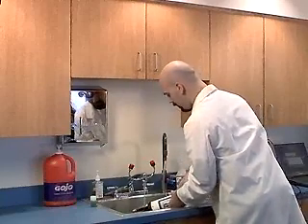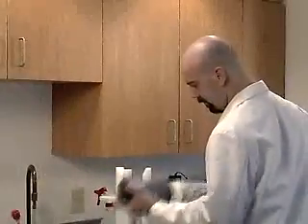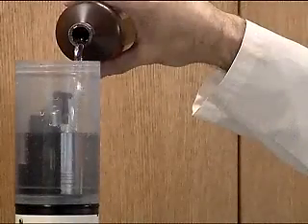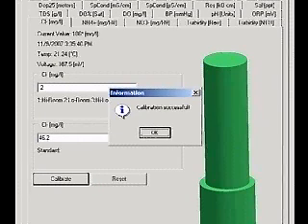Rinse the cup and sensors with deionized water and dry them. Fill the cup about 25% with the room temperature low standard and screw the storage cap on. Shake for six seconds. Remove the storage cap and pour the standard out. Fill the cup with room temperature low standard again, this time covering the ion tip and the pH sensor. Wait five minutes for the readings to stabilize. When the readings are stable, type a value of 2 in the first box to designate the low standard. Type 46.2 into the second box and click Calibrate.